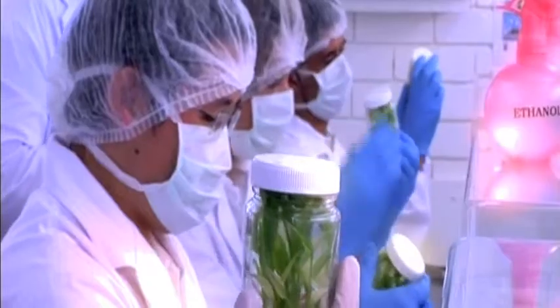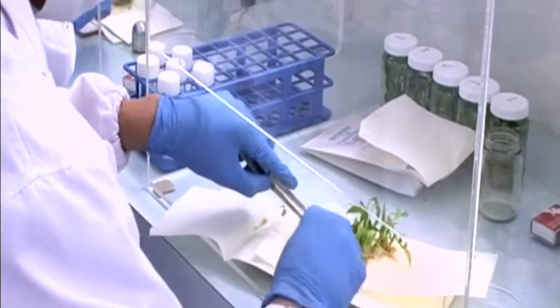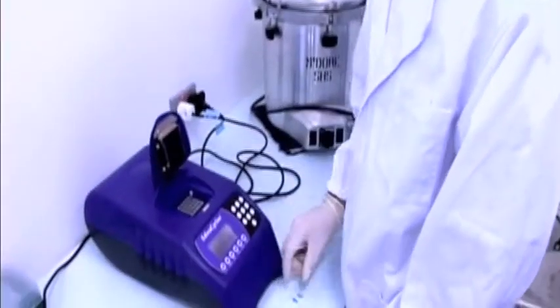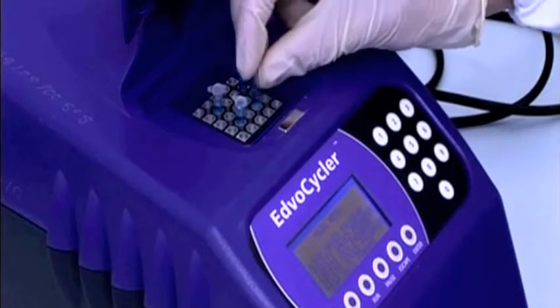The closest most get to cloning and working with DNA is watching television crime shows. But at Maroochydore State High School, students have become the world's first to clone a gene in the classroom.